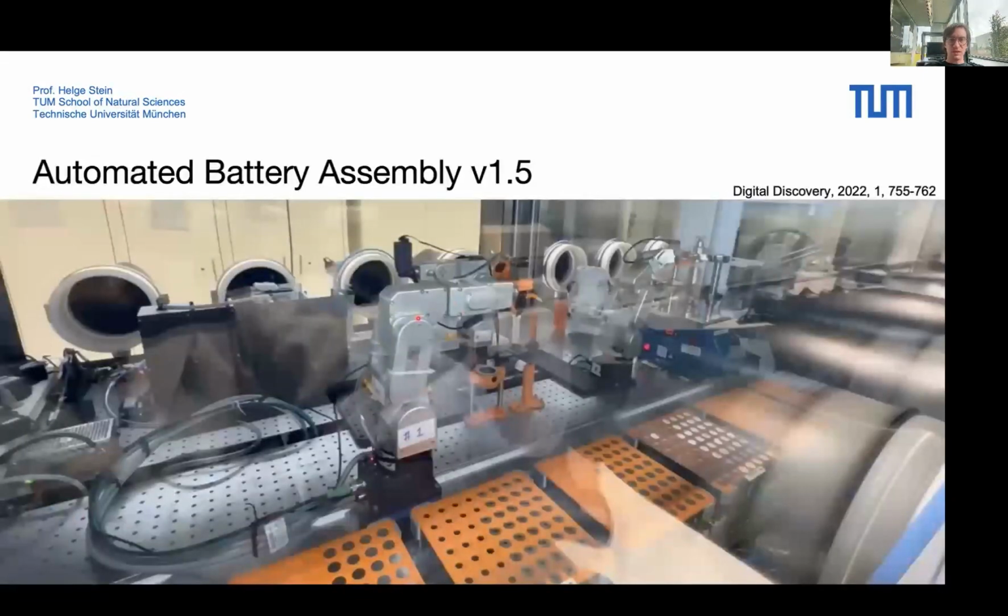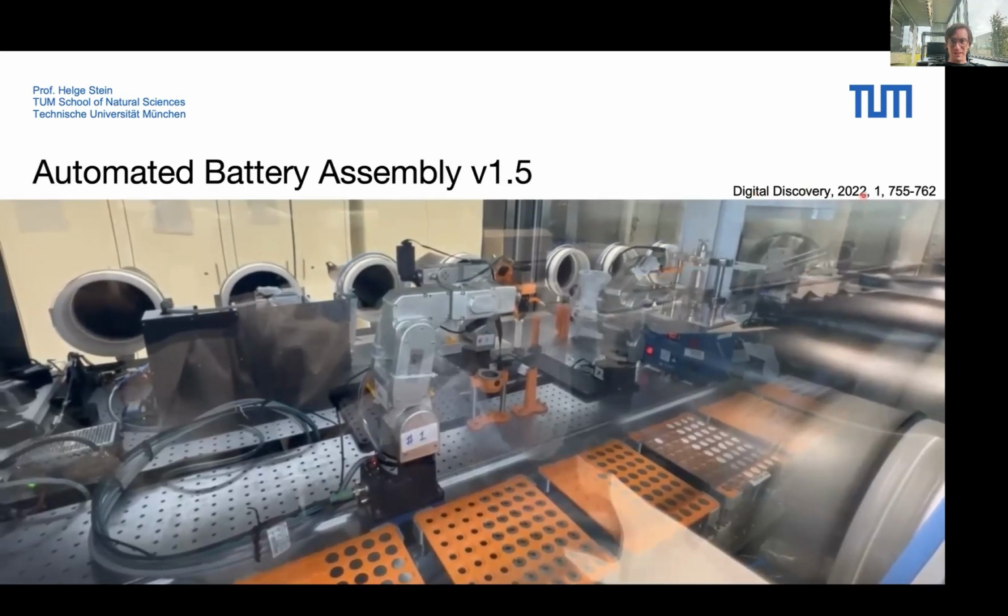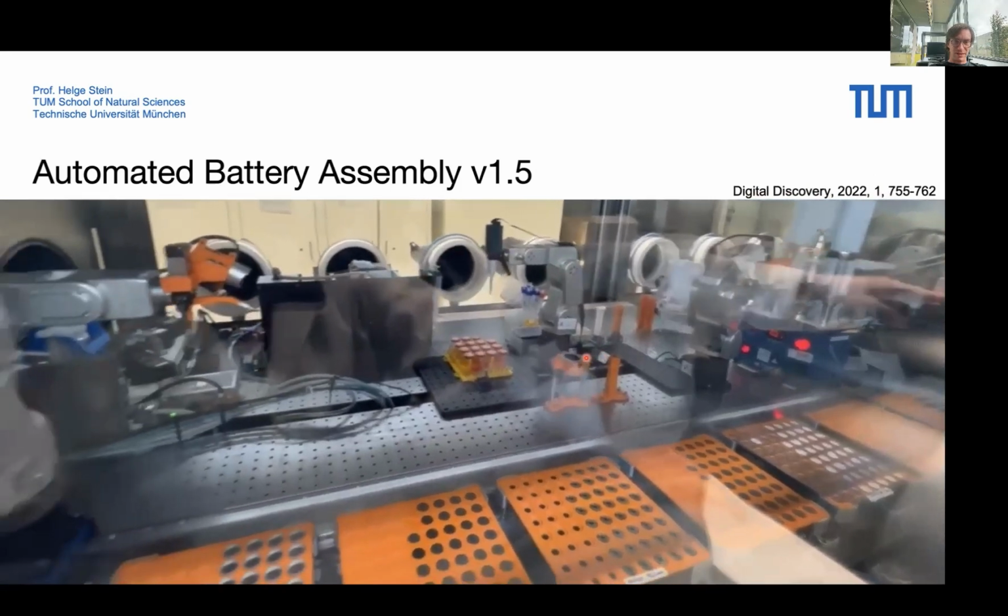Now, given that you have an idea what you want to do, and let's say you just made 500 electrodes, you want to somehow put this into a battery. This is our now relatively famous battery making robot that even made it into Tagesschau, so I'm quite proud of that. If you want to read all about it, it has been published in Digital Discovery last year.